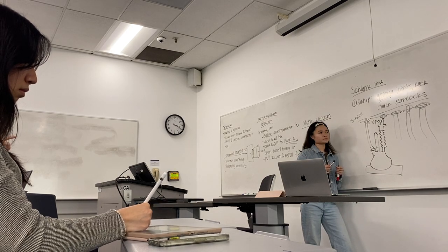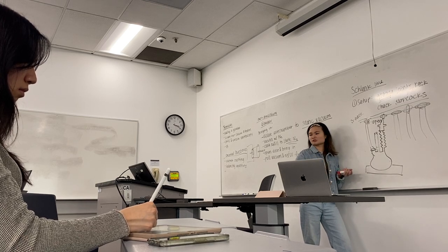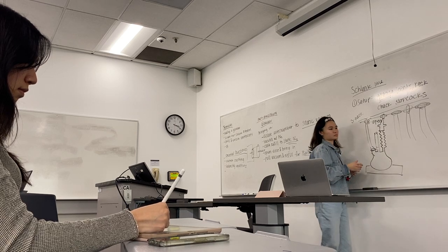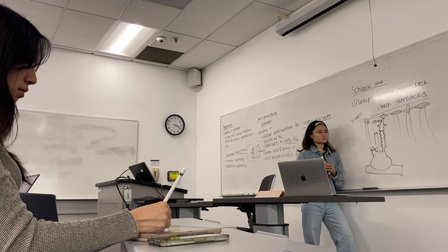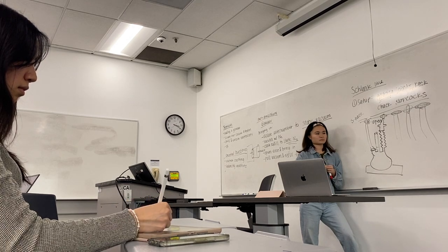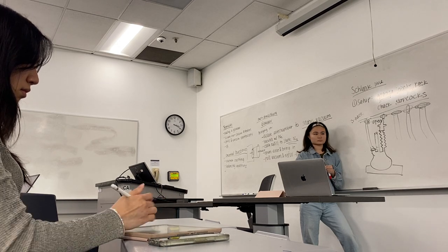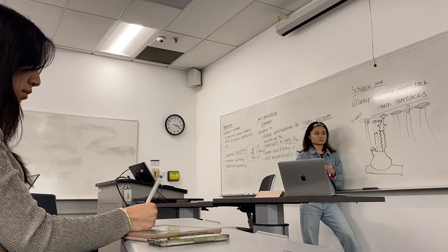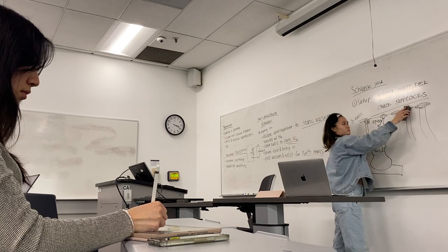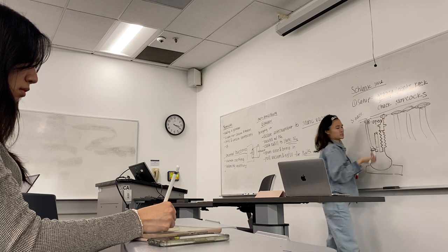So that is open to vacuum? Let's say it's open to vacuum. If it's open to nitrogen, you're just wasting nitrogen. For our case, we never used the liquid nitrogen trap this quarter, but if we did, that would be a major concern: if you left a stopcock open, you're sucking up air, and if enough of it condenses, then that's explosive. So you typically want to keep everything closed unless you're actively using it.